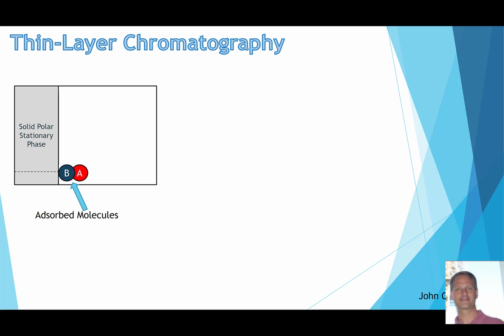Now, if we look microscopically at what's happening here, here is a close-up view of our TLC plate. We have this solid polar stationary phase, so that's the coating.